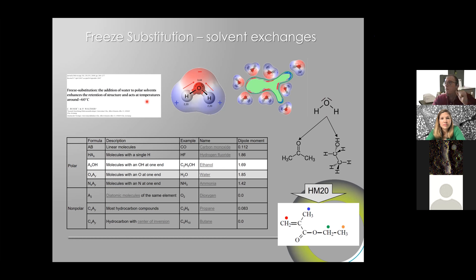One way to understand that is that the full dehydration of your proteins might collapse the fluorescence, and might make the proteins dehydrate so much that the stain has a hard time going into the proteins to contrast them. That's an interpretation. Again, I'm not a pure chemist, so this is a visualization of the idea. If you keep some water, you will keep the very core structure of the proteins, including the fluorescent proteins.